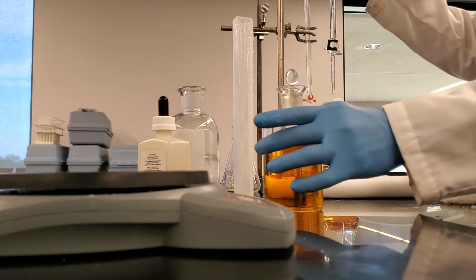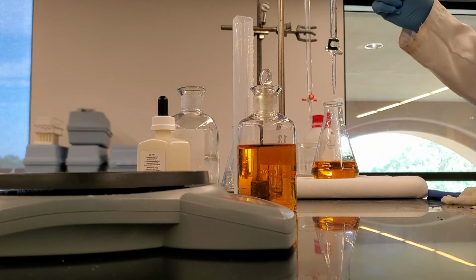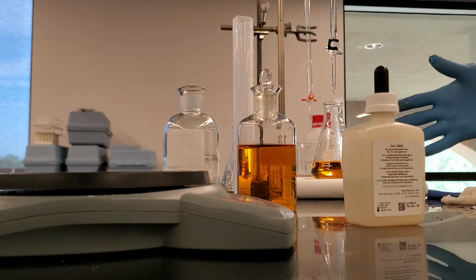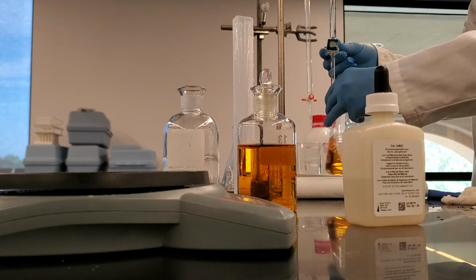So this is the titrant, 0.02 normal sodium thiosulfate. We're going to titrate that to a pale yellow color and then add the starch indicator. So what we have is kind of a dark yellow. Let's titrate and see if we can get it to a light yellow color.